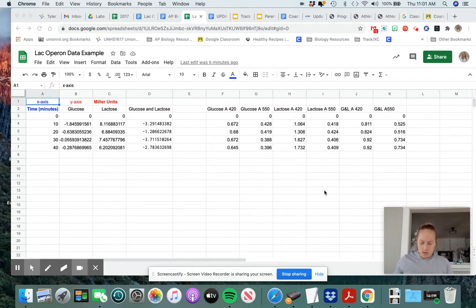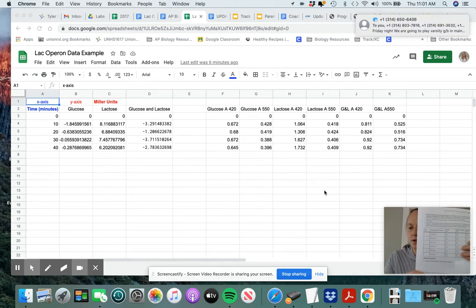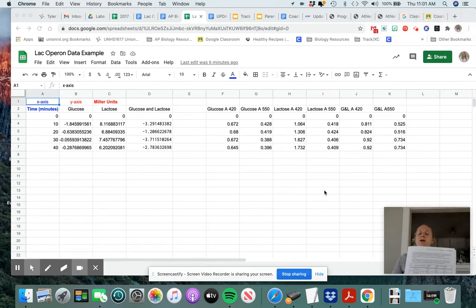You will also need your quantitative table. You'll need all the data from that to do this. If you were in 2nd or 3rd hour, then that means that you only got to 30 minutes. But if you were in the 4th and 5th hour class, I believe every group got to 40 minutes. So depending on how far you guys got, one of you guys may be missing that time component.